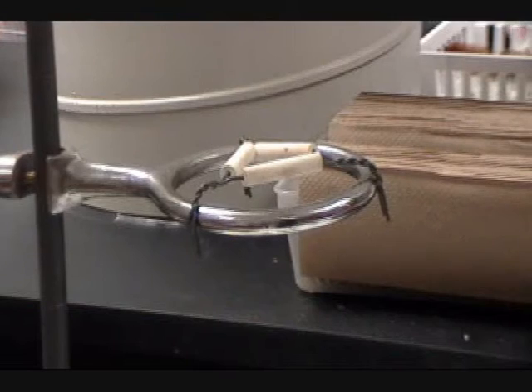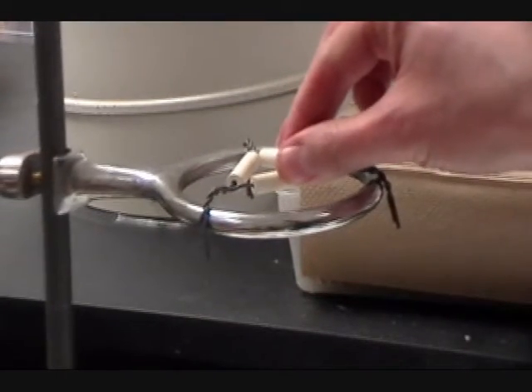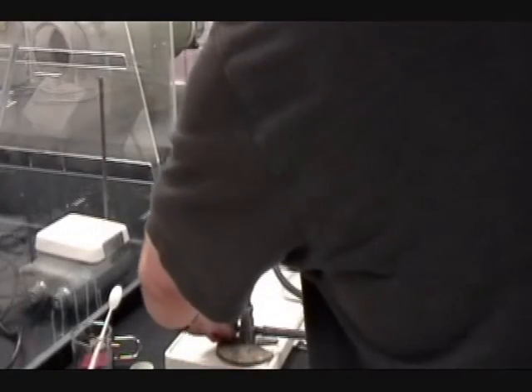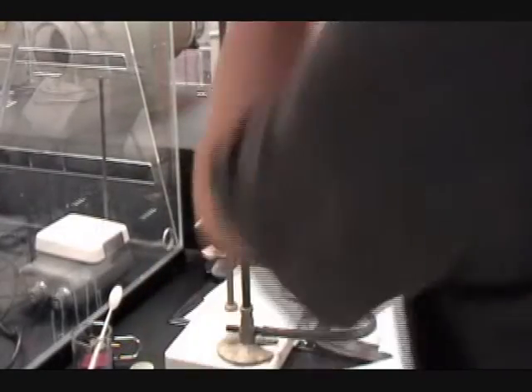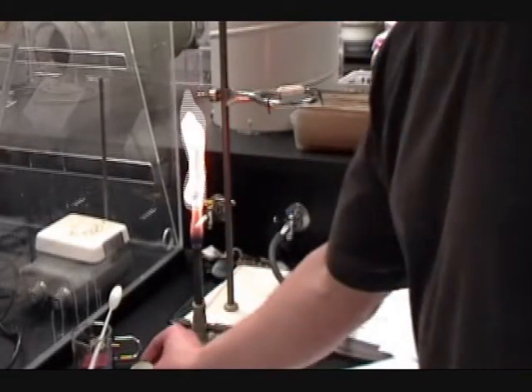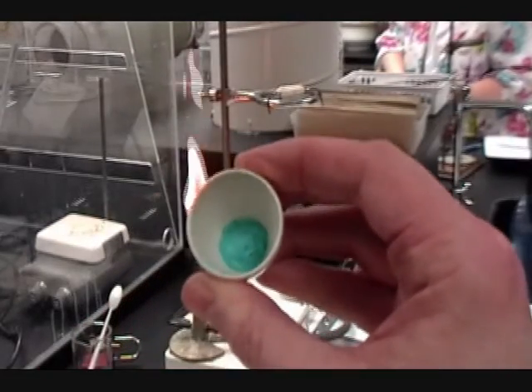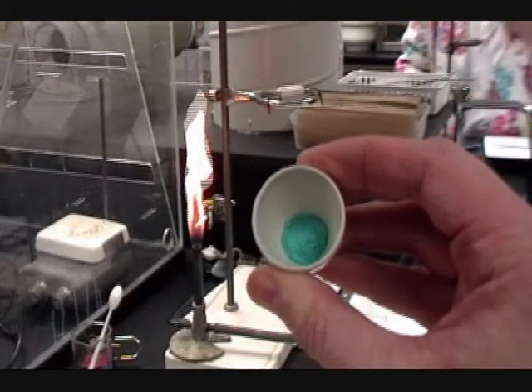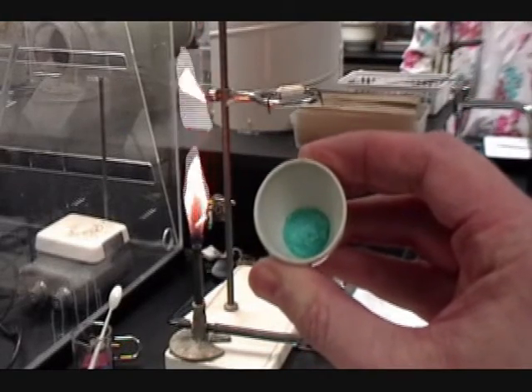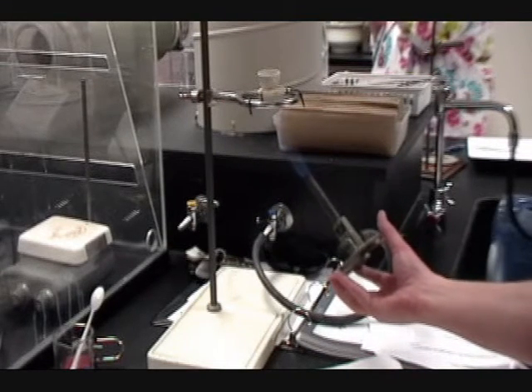So the first part of the experiment is going to be to drive off that water. We're going to take your sample and put it in a crucible and, without the lid, heat it up for a couple of minutes with the Bunsen burner. This will drive off the water, and as the water evaporates, your copper chloride compound will turn from a blue-green aqua colour into a dark brown colour, which is the colour of copper chloride when the water is driven off.